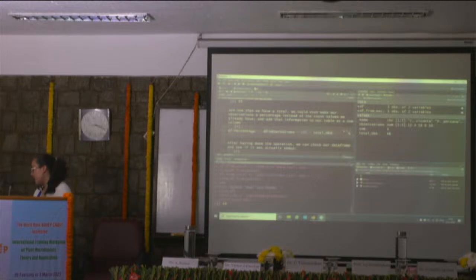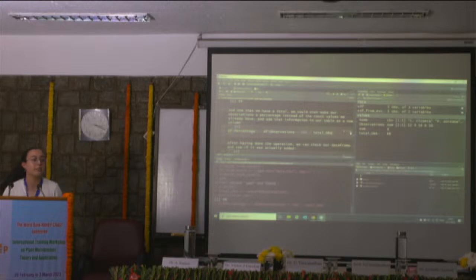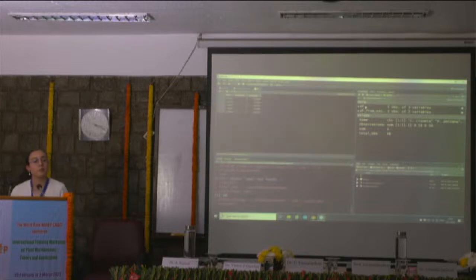So if we run the chunk of code and open df again, so click on the name of df, now we have 3 columns, one called percentage, with the results. Good, right? RStudio is very cool.